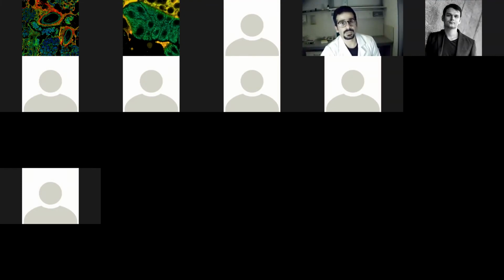Okay, here we are. And share the screen.